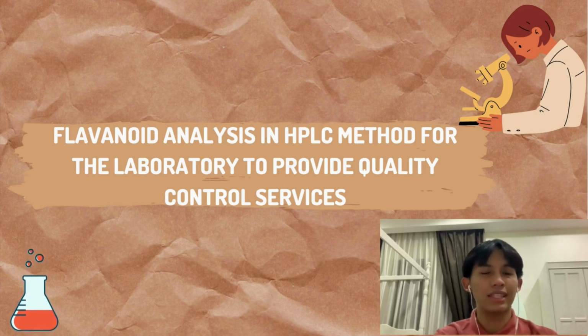Our group chose flavonoid analysis in the HPLC method for the laboratory to provide quality control services.